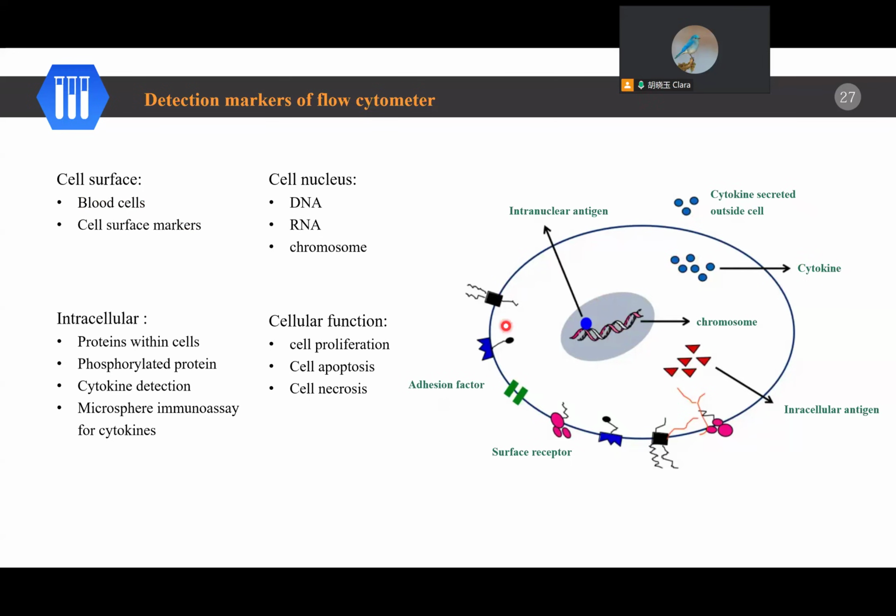So we have to use other steps to keep the proteins or the secretions within the cell. So the principle is easy: as long as you can find reagents that can be used on the machine, you can detect. But in real life, it has so many other situations.